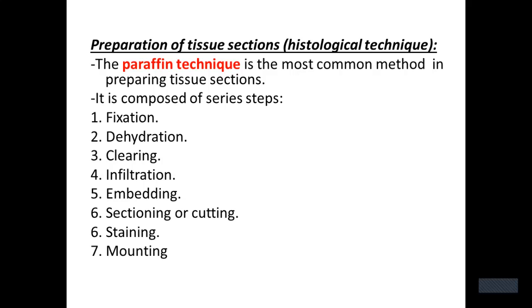These seven steps are very, very important for preparing the tissue section. Beginning with the fixation.